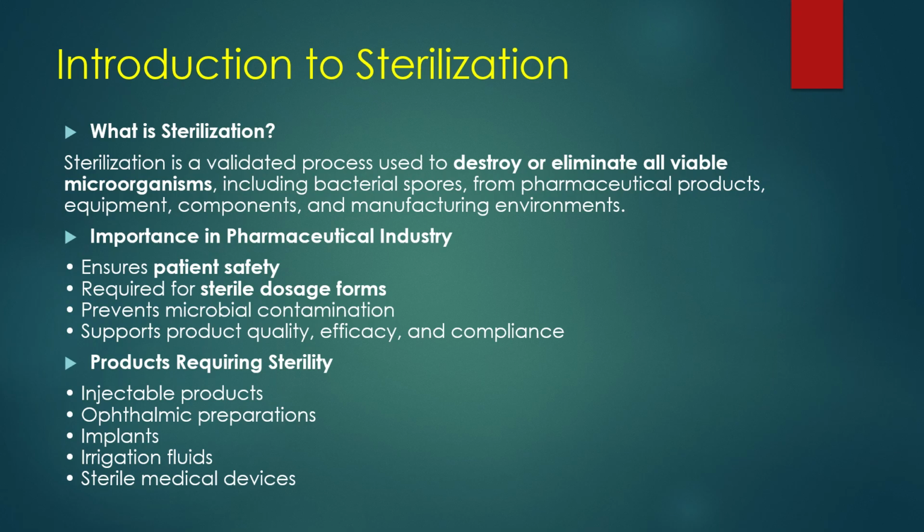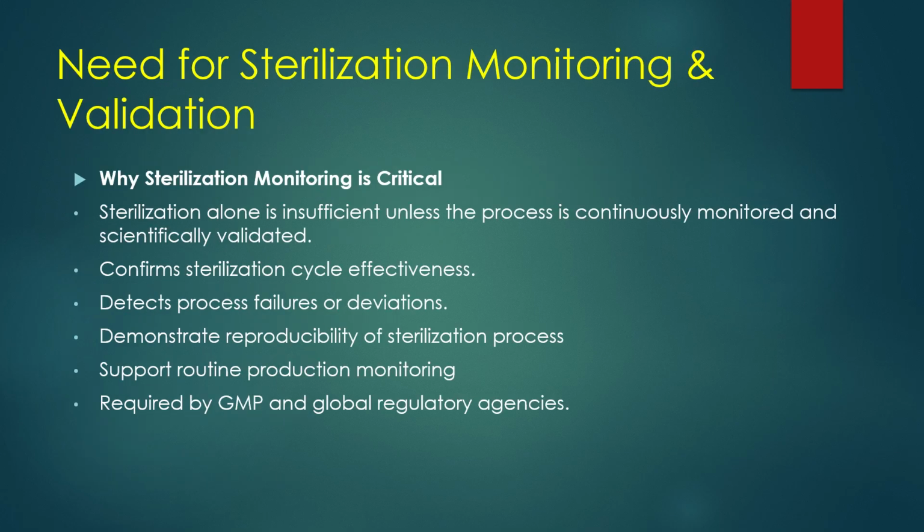Which products require sterility? Various pharmaceutical products require sterility to ensure safety and effectiveness. These include injectable products, ophthalmic preparations, implants, irrigation fluids, and sterile medical devices.